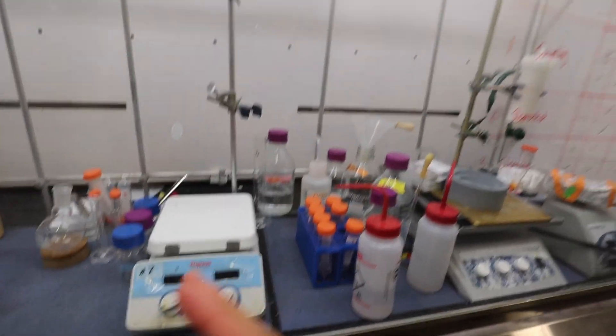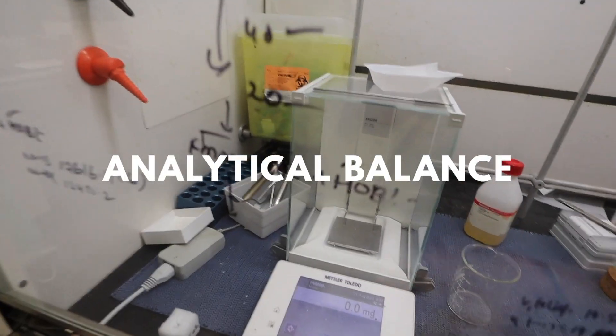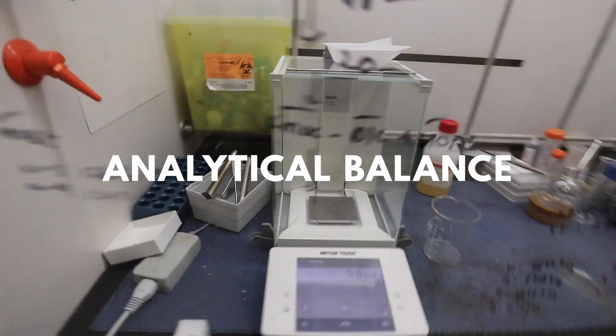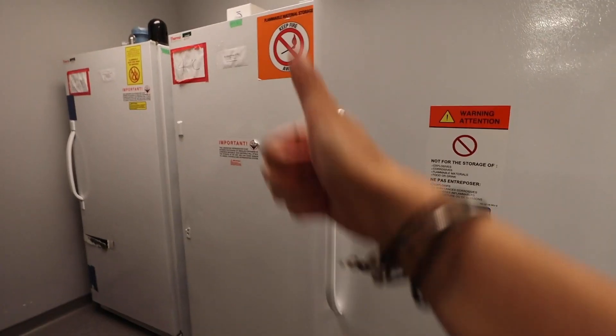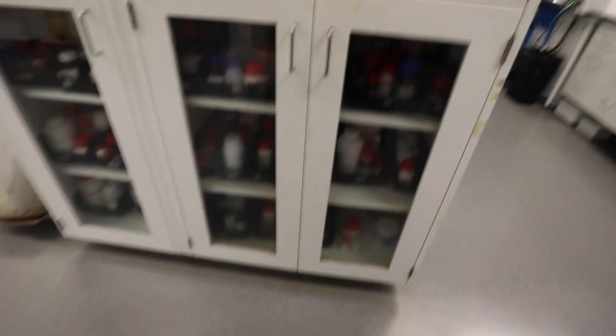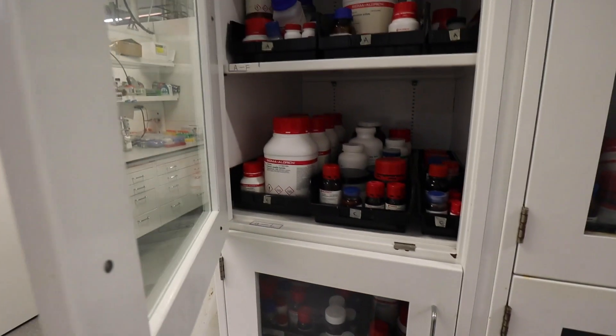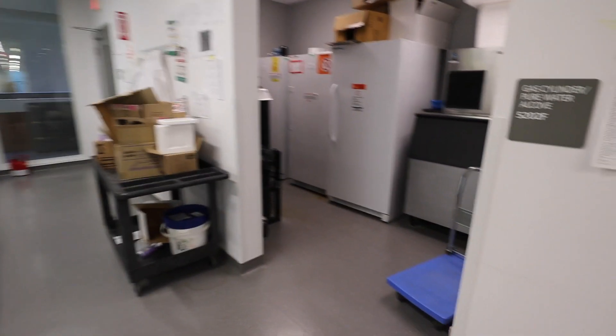This hood, half of it is Lucas's stuff. So Lucas does his peptide synthesis here. And then this is the analytical balance where we weigh things. And this is Lucas's bench. Our fridge and freezer. This is where we store all of our chemicals just labeled alphabetically. And obviously there's still chemicals in the fridge as well.